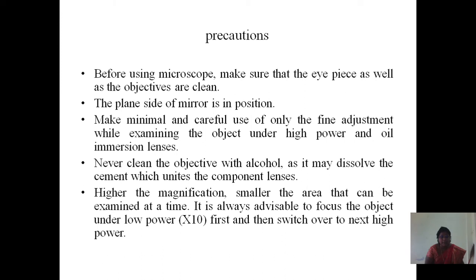Precautions to take when using a microscope: before using, make sure that the eyepiece as well as the objectives are clean and the plain side of the mirror is in position. Make minimal and careful use of only the fine adjustment when examining objects under high power and oil immersion lenses. Never clean the objective with alcohol as it may dissolve the cement which unites the component lenses. It is always advisable to focus the object under low power of 10x magnification first, and then switch over to the high power.